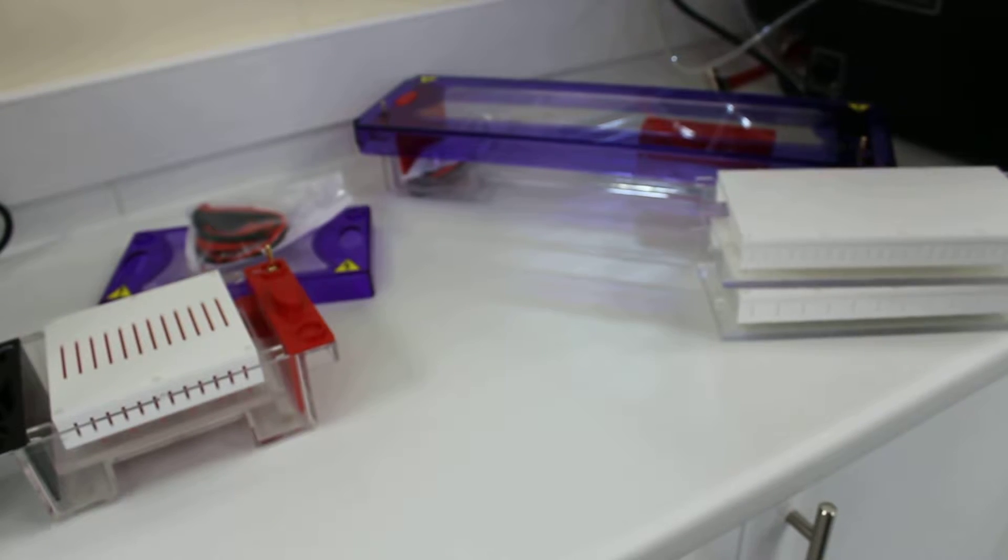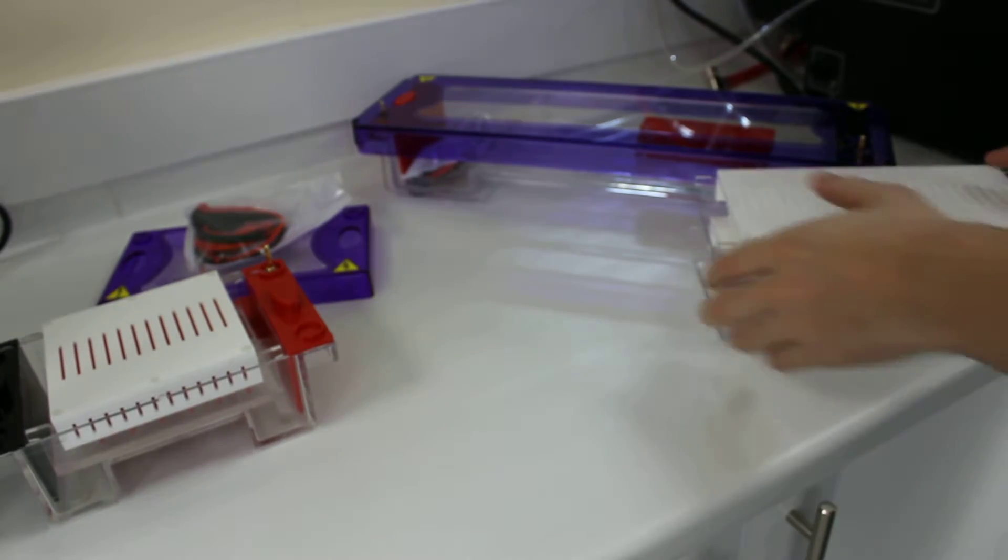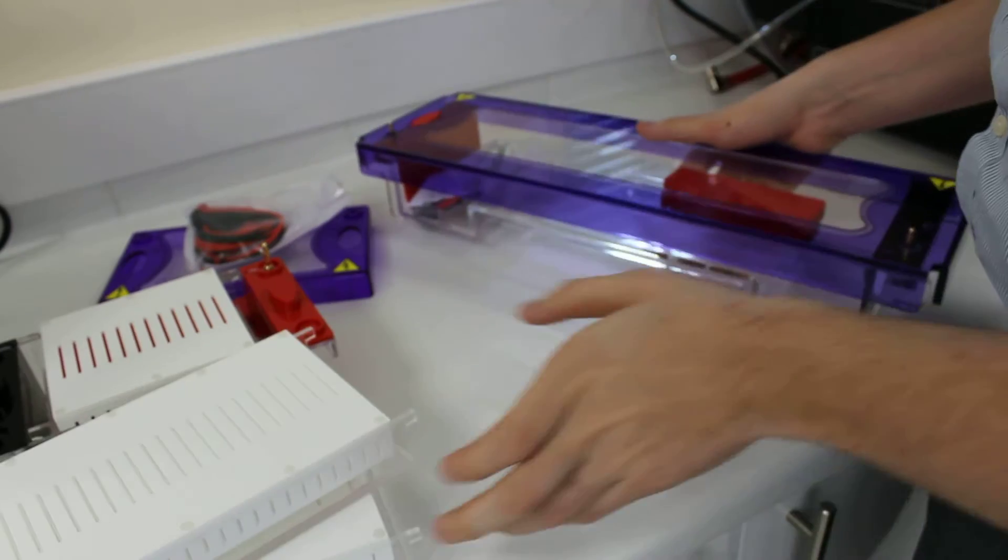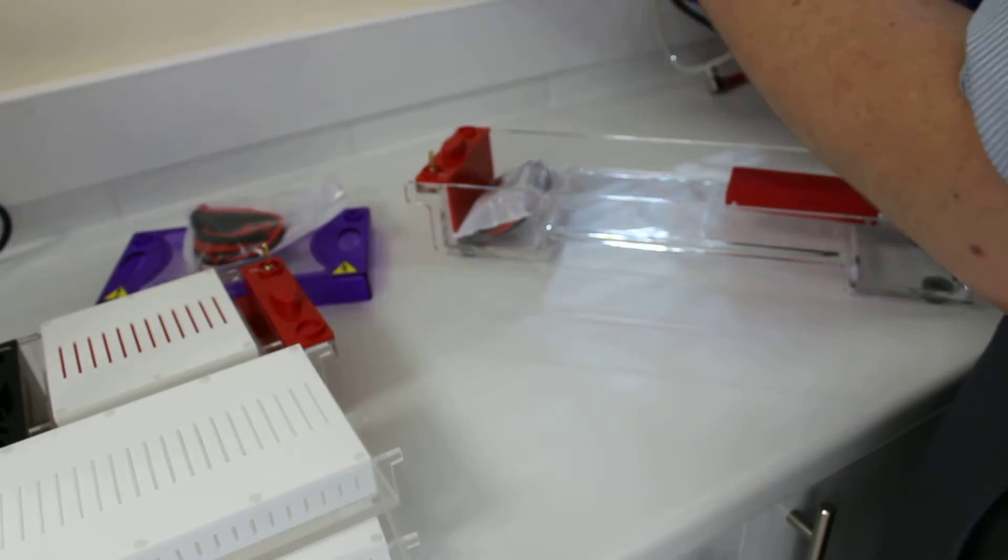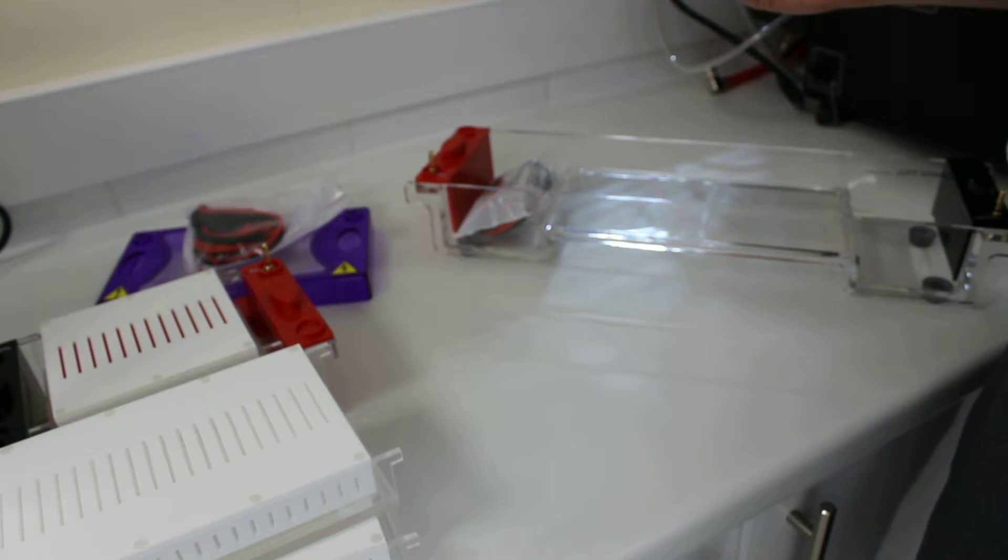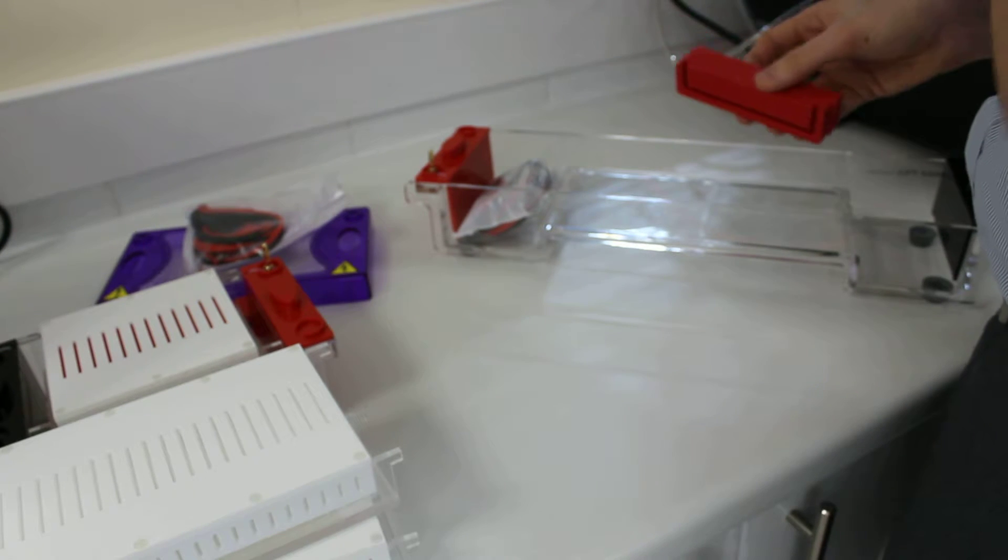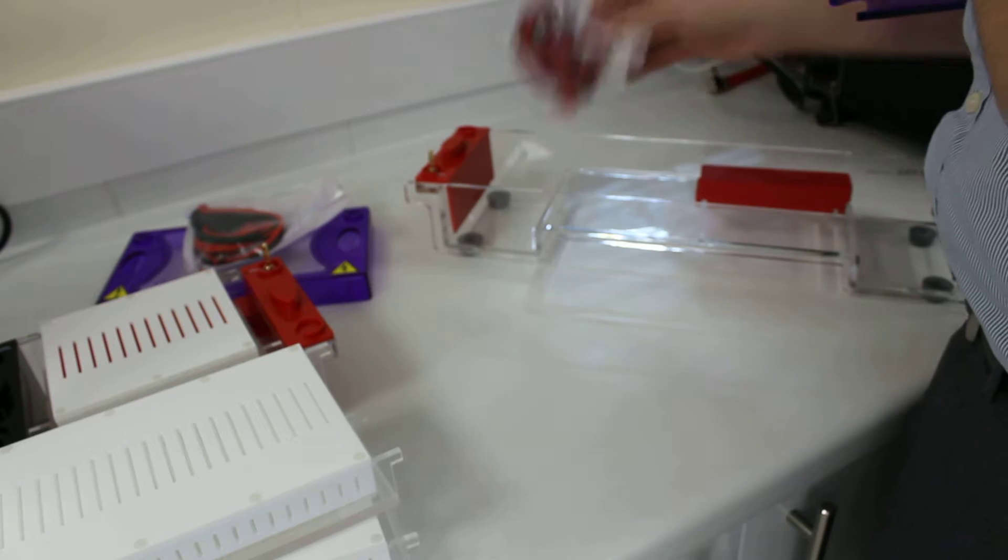So that is the MS-MIDI-96 system, which is the smaller of the systems. We then have the MS-MIDI-96ST. That comes in the longer tank. It is about twice the size of the other tank. Then you get the tank with the lid. Casting dams are actually the same because the width of the trays is the same and then your electrodes.